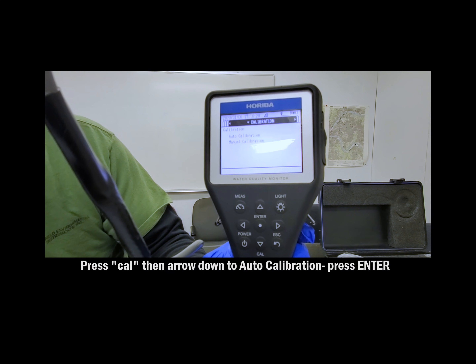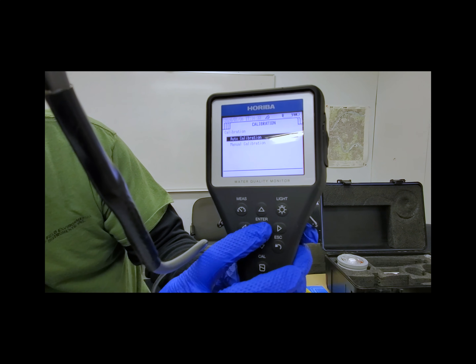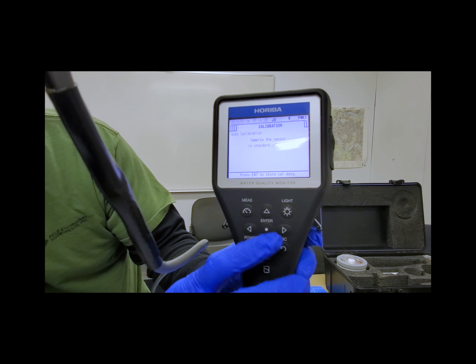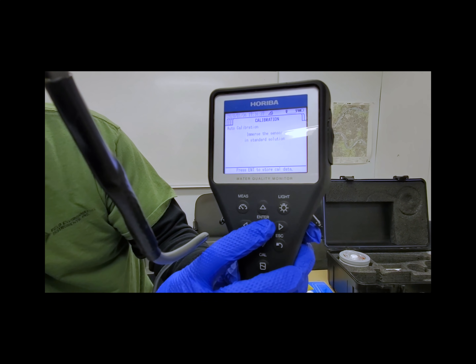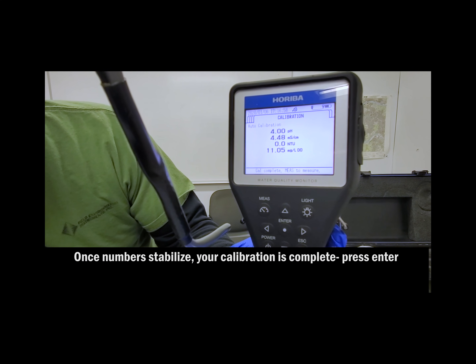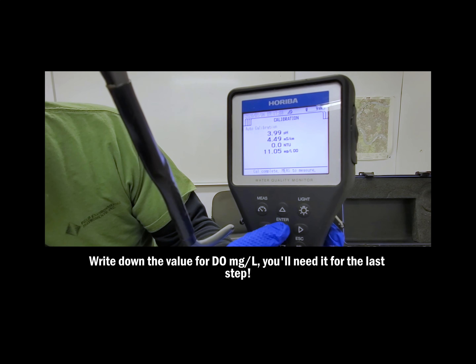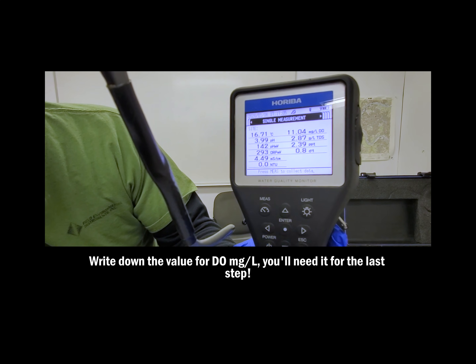Once the probe is inserted, press CAL, then arrow down to auto-calibration, and press ENTER. Press ENTER again if it prompts you to immerse the sensor again. Once the number is stabilized, your calibration is complete. Write down the number that you get for milligrams per liter DO — you'll need it for the last step. Then you can press ENTER.